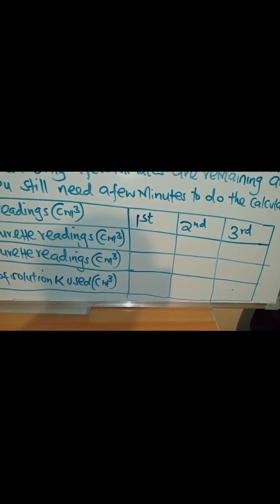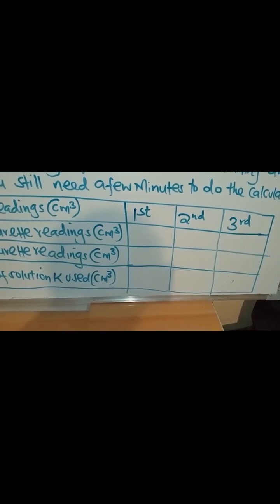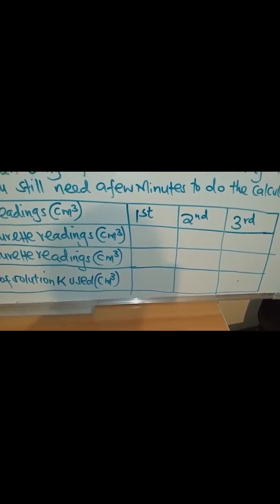And if you are lucky to have done the first, the better. If time is there, if the chemical that you have remained with, after maybe it was spilled, is enough to at least do the first, well and good. That is even a better situation. But if you have an empty table, this is what you should do.